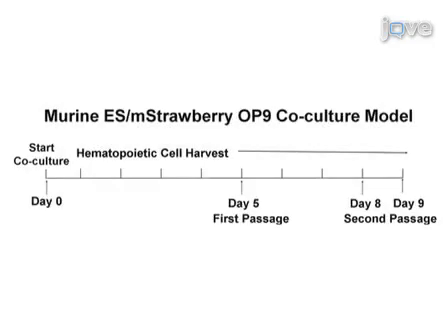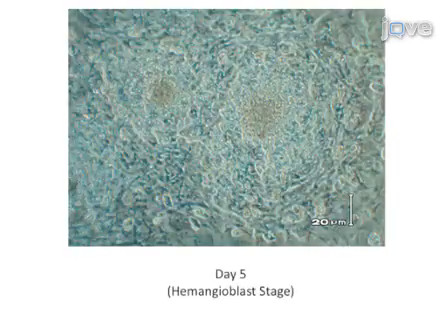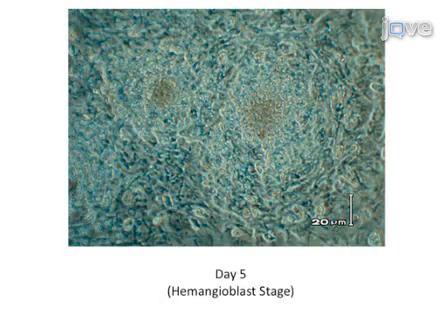The ES M-strawberry OP9 co-culture system can be used to model hematopoietic development. Outlined here is an overview of the co-culture time course. Days when differentiated ES progeny need to be transferred to new M-strawberry OP9 cells are indicated. Proper differentiation of ES cells on a confluent layer of M-strawberry OP9 cells will result in the production of FLK1 positive hemangioblasts at day 5 of co-culture.